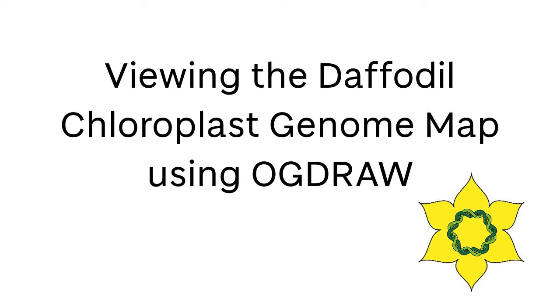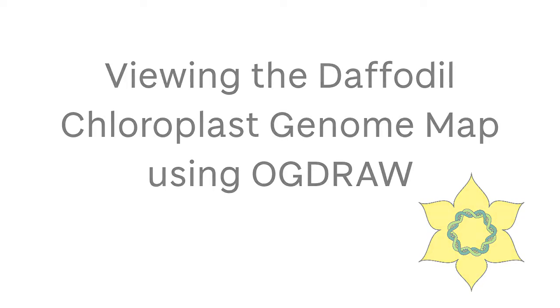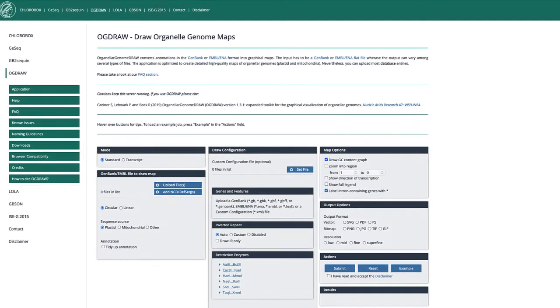In this video, I will look more closely at the daffodil chloroplast genome using the web-based tool OGDRAW.